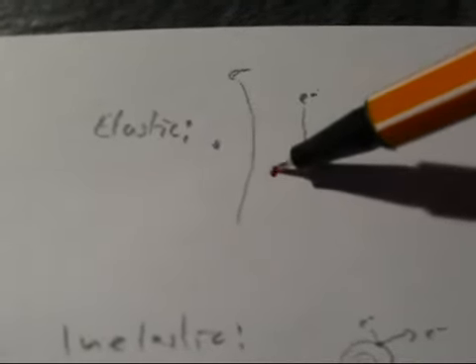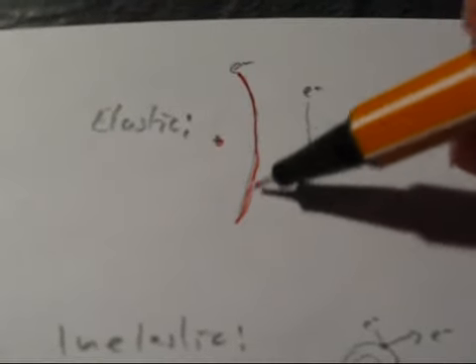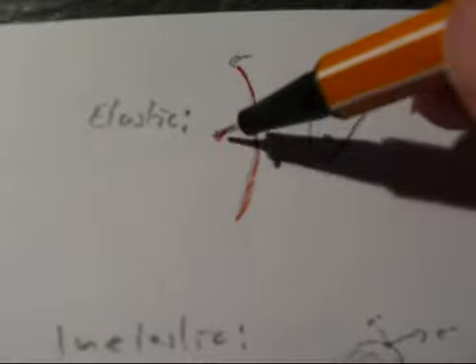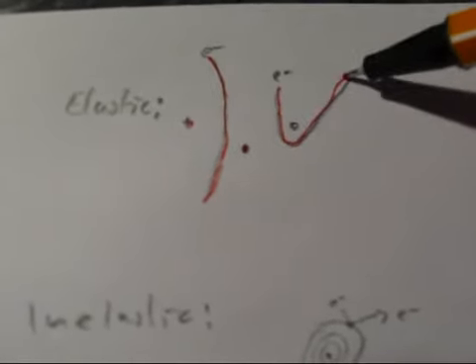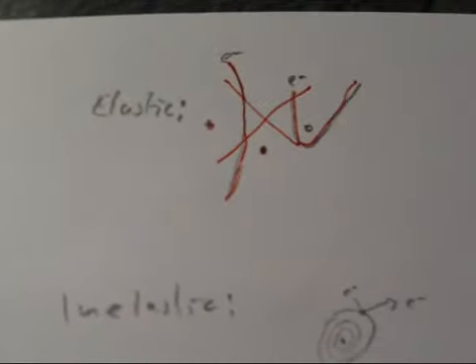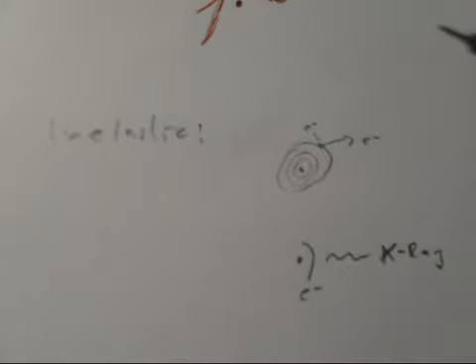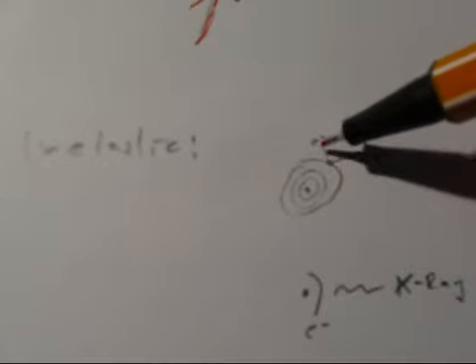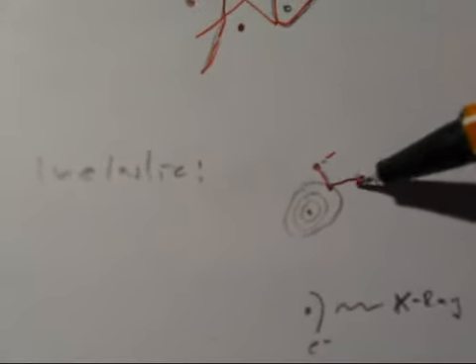Those are atoms in the material that we want to analyze, and the electron may just get scattered a bit without any actual transfer of energy to the atoms. That is elastic scattering, or it might even be backscattered to where it came from, sort of. But that's not really important for the analysis. And also inelastic scattering may occur. That may be, for example, secondary electrons, when the electron from our beam hits an electron in the outer shell, in the valence shell, and the electron gets knocked out, but this isn't important for analysis either.